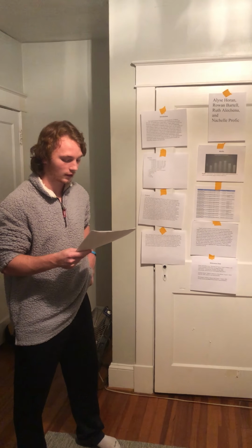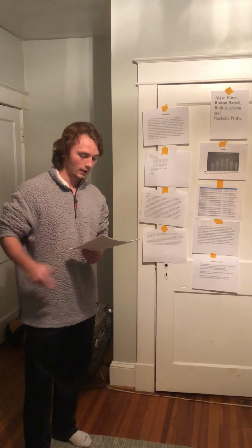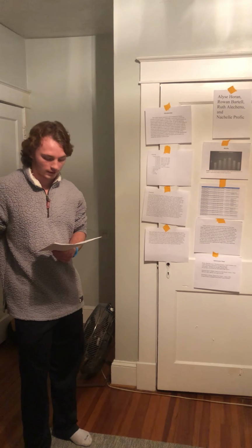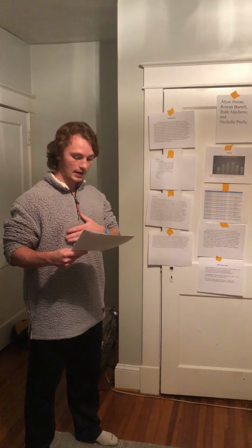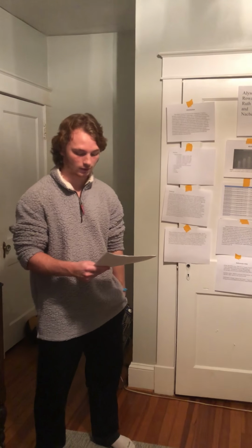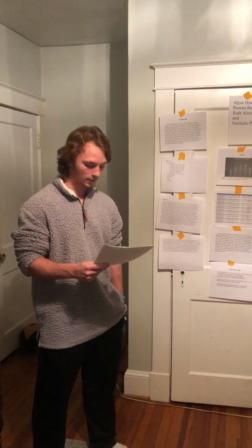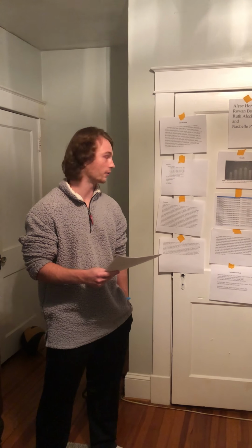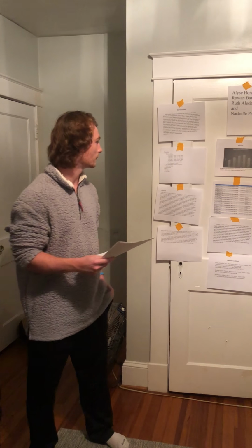The certainty of whether the concentration or temperature produces the maximum rate of trypsin activity is unknown due to limited testing, small differences in values, and the possible sources of human error. In lab, there are many factors that could possibly contaminate your data. When pipetting, you must be very cautious and precise, and there's always room to get better at pipetting. A lot of times there are air bubbles that affect transferring liquids from one cuvette to another.